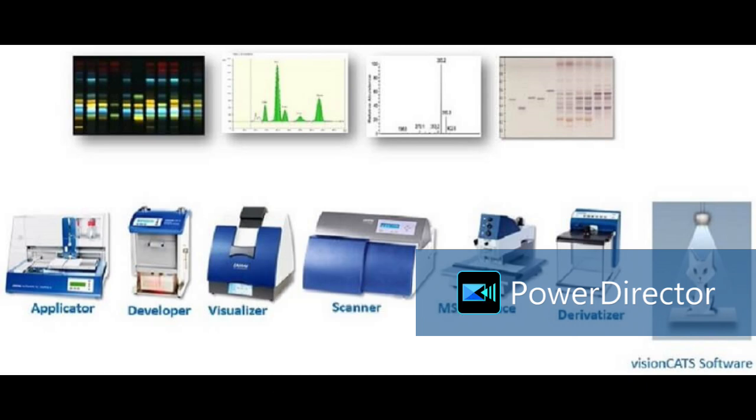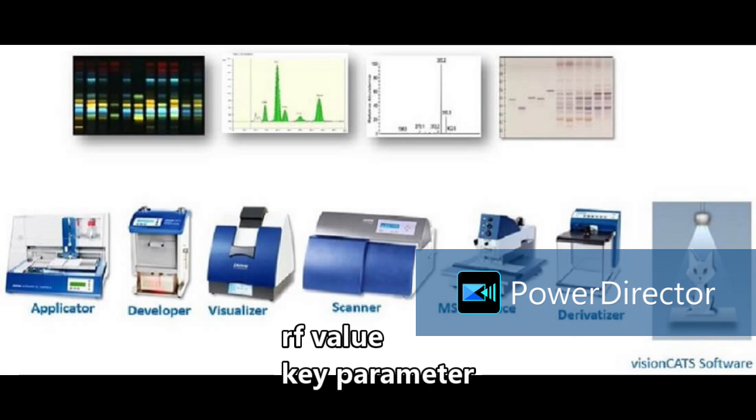So RF value is the key parameter for qualitative analysis. If the RF value of this band and this band is the same, and the color is also the same, then we can say this band is detected in the sample at the same RF value. This chemical component is present in this sample.